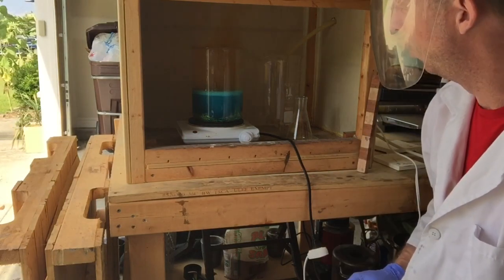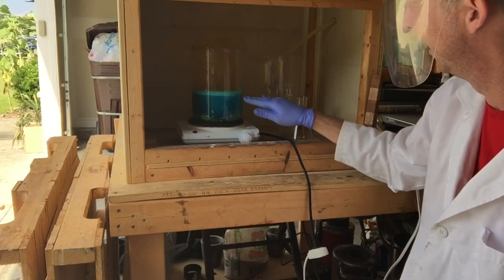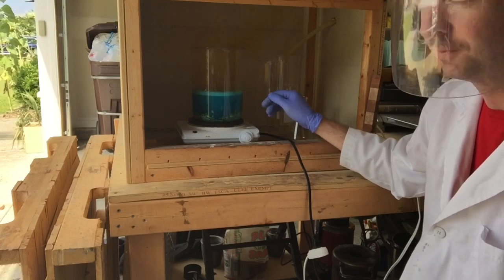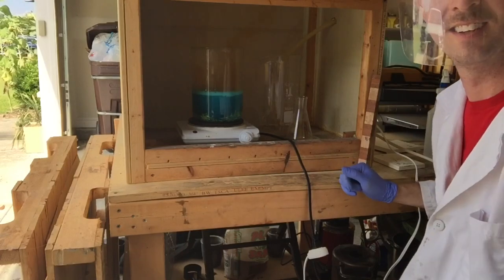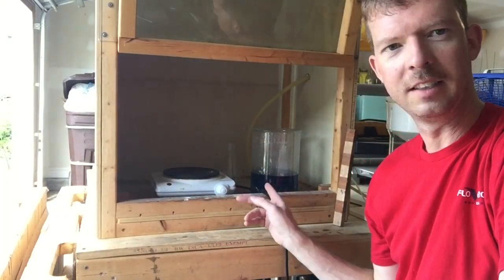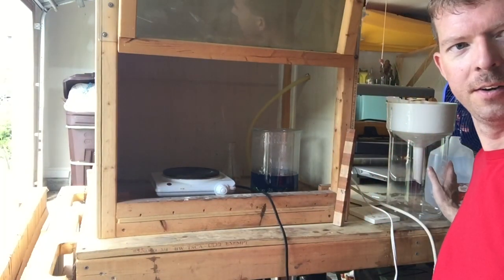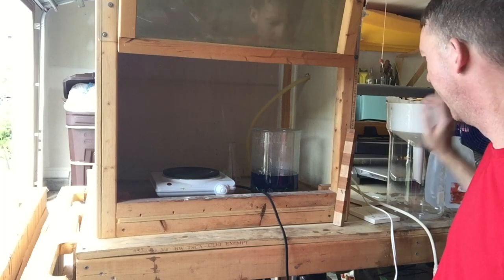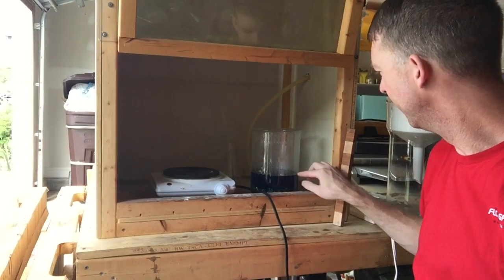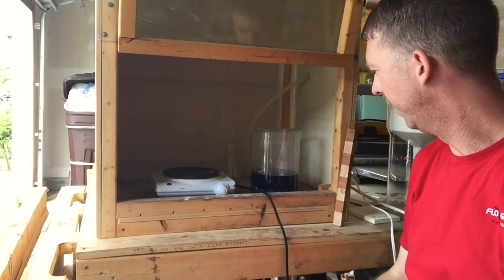I got really lucky — it started foaming up real bad but it's kind of settled down now. That could have been a huge disaster. I've got it off the heat now and I'm just going to let this cool. I've got one coffee filter and I'm going to filter out these little gold flakes — there's a ton of them floating around. We're going to catch all these gold flakes and then get the reaction going again.